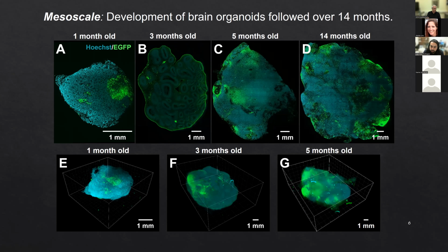That's why, with this technique, we have the ability to image the complete organoids. For example, we see that the cluster actually remains along development, and we see only a few cells that are moving in the brain organoid, probably due to the proliferation of these cells over time. These stem cells start to divide and form new kinds of neurons and cells inside, and they move to different positions.